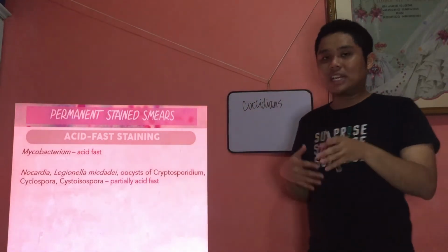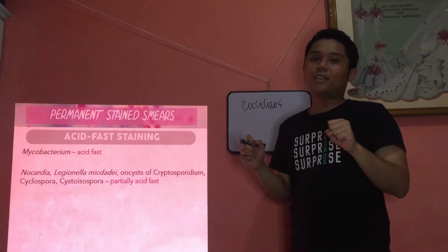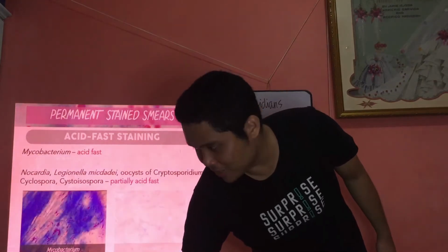So therefore, since they're partially acid-fast, they're not really totally red. Or they cannot hold on to all of the carbolfuchsin. But they can still be stained by the carbolfuchsin. Okay, later there's a diagram. So here's an example of a picture.